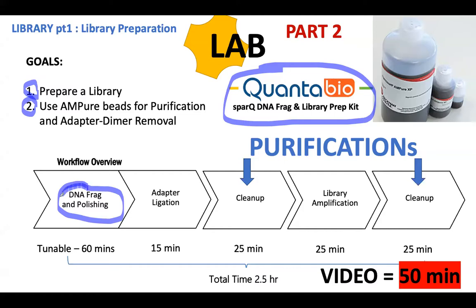So it's divided in 5 parts. The first part is fragmentation and repair with A-tailing at the same time. The fragmentation is enzymatic, okay, so it's not sonication. And without purification, we proceed directly to adapter ligation, which is the second step. After the adapter ligation is over, we're going to perform an AMPure beads purification, a cleanup.